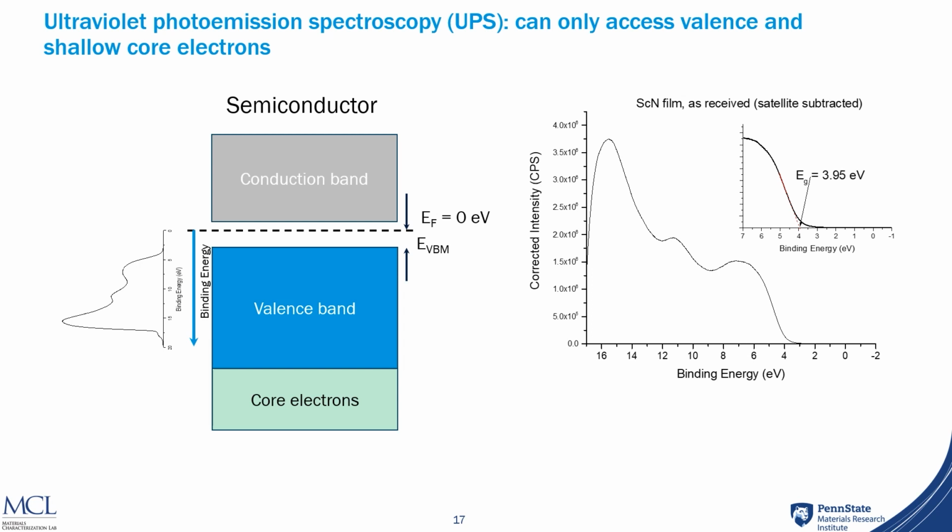Now, I should preface this that a lot of these measurements, certainly the valence band maximum and the work function, require that the sample be grounded. It be semiconducting or conducting. This technique for measuring these particular parameters does not work very well if the sample is insulating. So we go to great lengths to try and ground the sample to the spectrometer. The band gap measurements through REELS are a different story. That measurement is not really dependent on the sample being conductive, somewhat surprisingly.